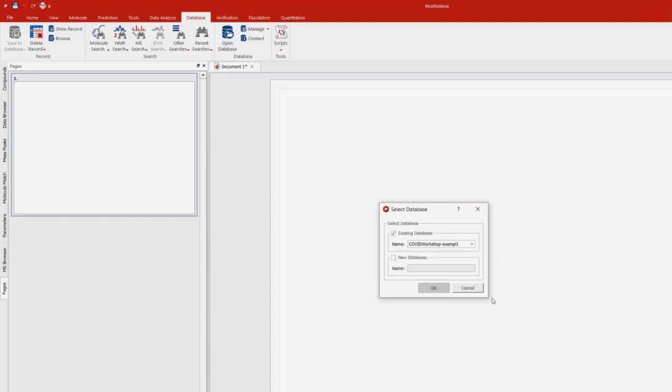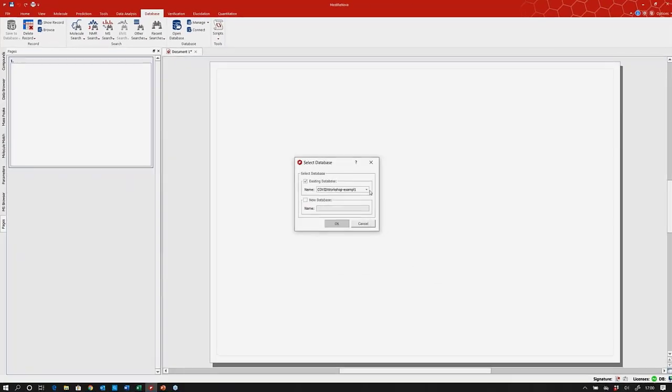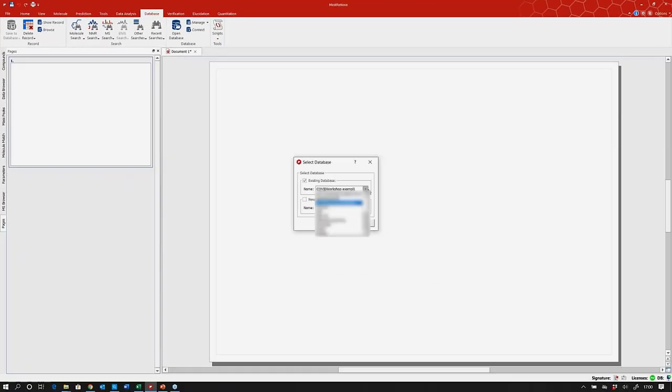This dialog is asking which database do you want to save your data to? At the moment, you probably only have one, although you may have a test database that comes by default. So you need to select the database we have just created. As you can see, I have a number of databases running, available. So I've just chosen that database, and now we're going to click OK.